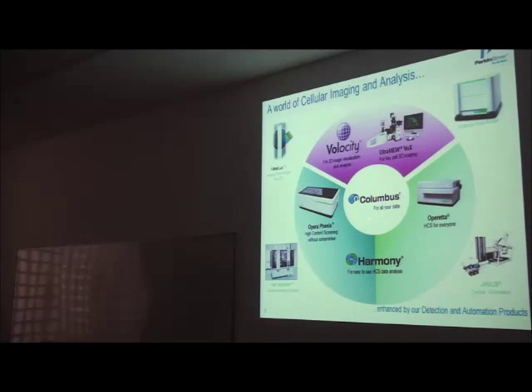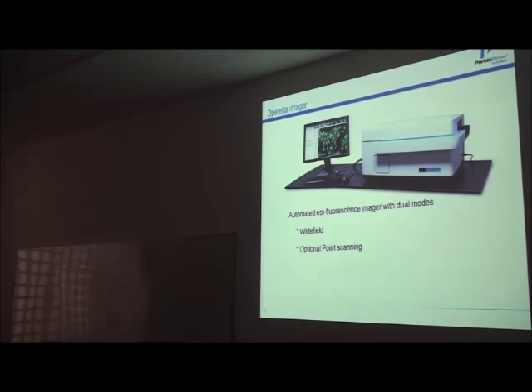What we have here is Columbus in the center, and we have two devices now, Operetta and Opera, both controlled with the same software, which is called Harmony. And we have here a kind of standard confocal microscope, with very nice 3D software for image analysis and also image data visualization, right? So I'll just start with the Operetta. That's the machine we have here downstairs.